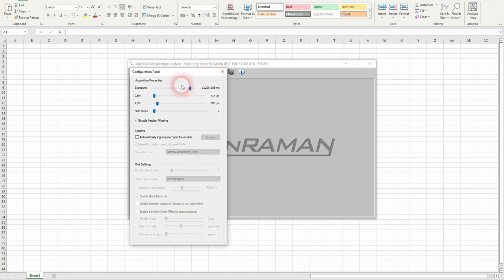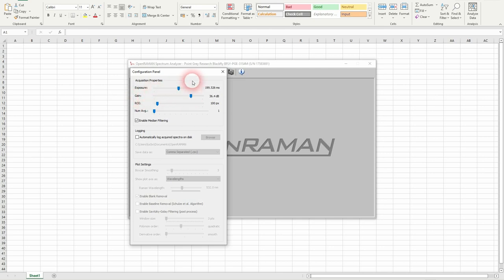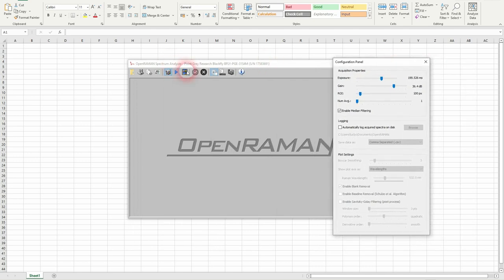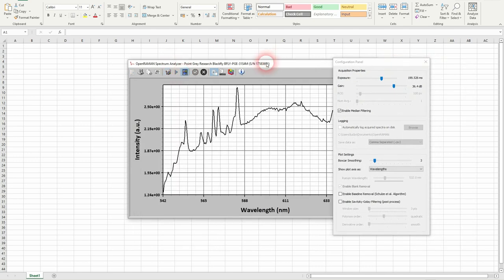I will check in the settings and I will put about 200 and a lot of gain. Then I will click on the live view image.